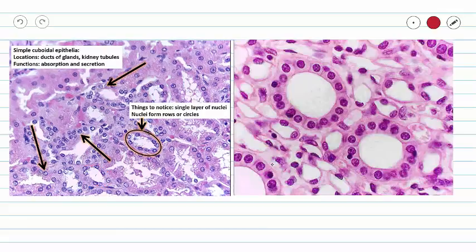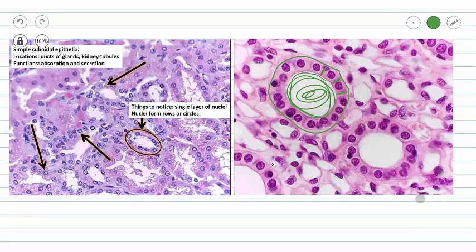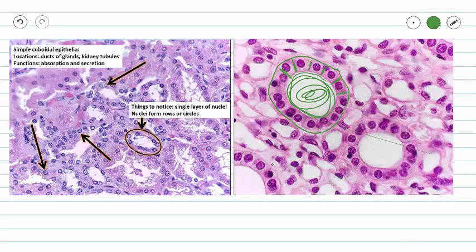How beautiful is this slide. So again we have a nice lumen, our empty space. We're always going to see that with epithelial tissue, some sort of white space. And then we have our simple cuboidal epithelium in one layer going around that lumen. And in this slide we don't have to make up the lines that divide our cells. We can actually see some of those lines here in between our beautiful round nuclei.